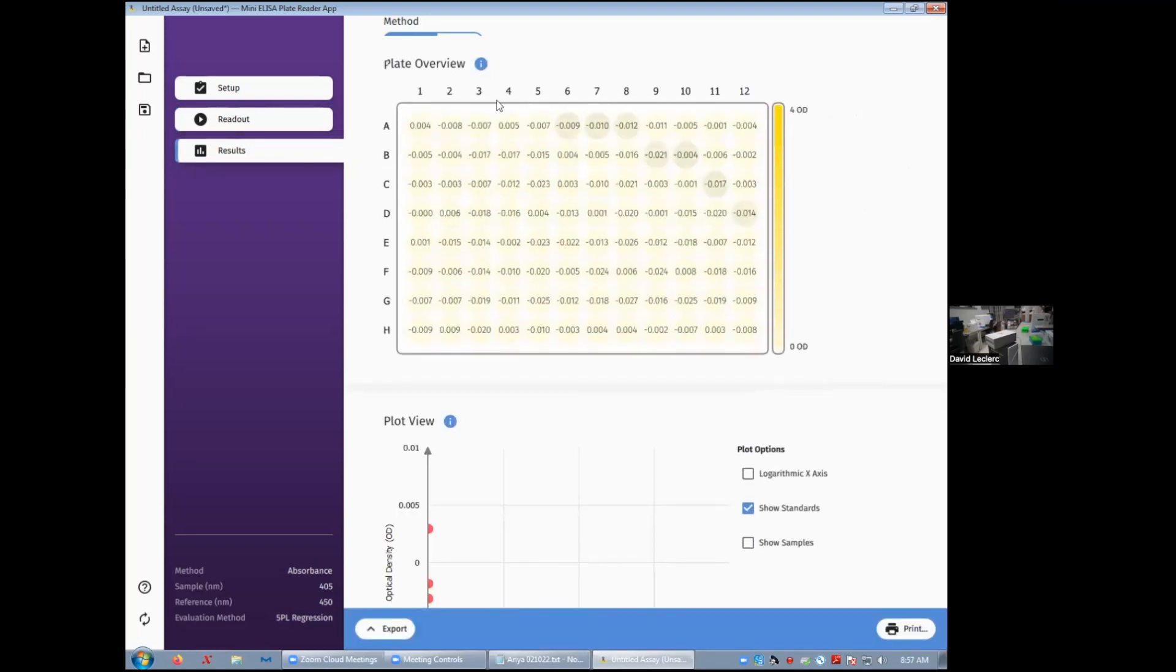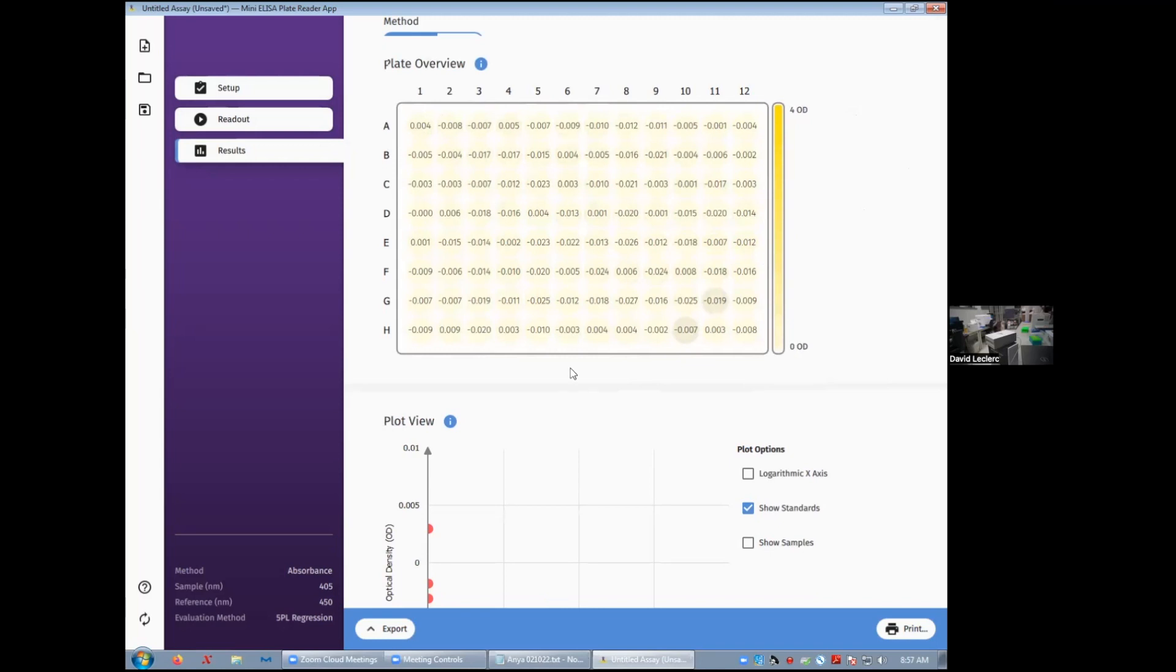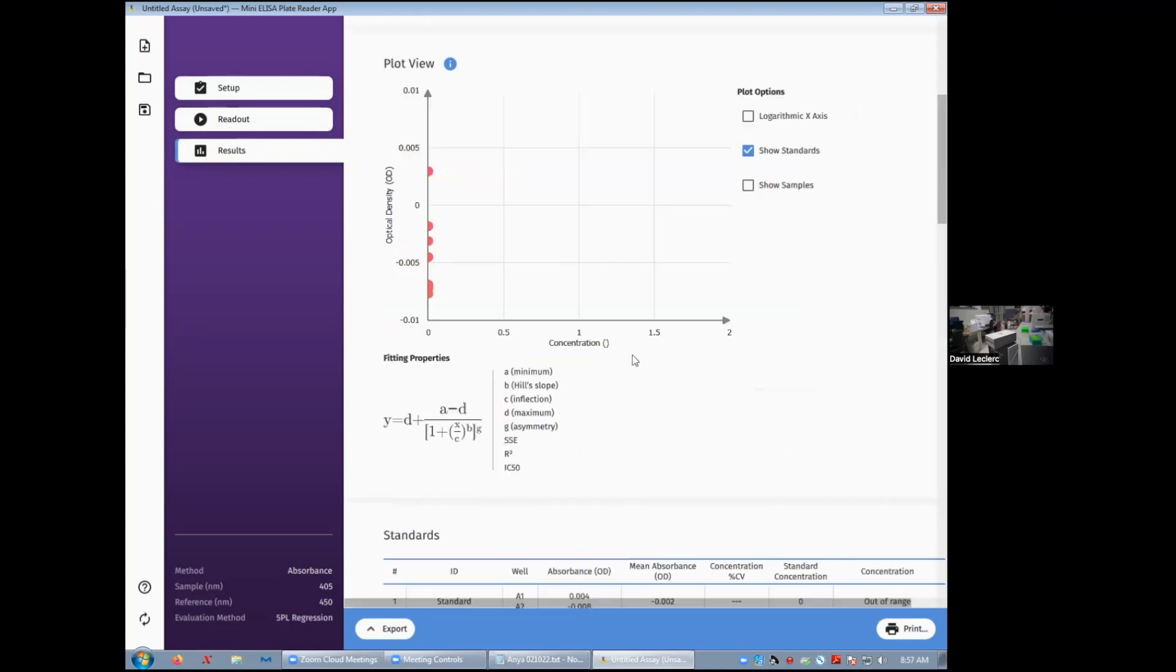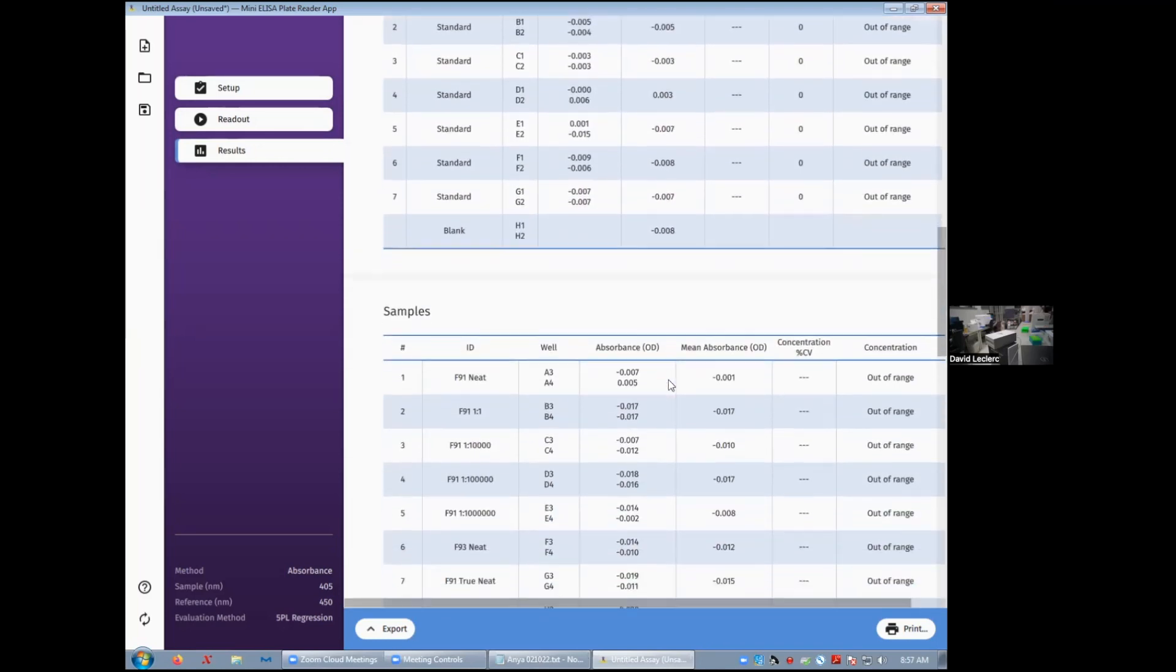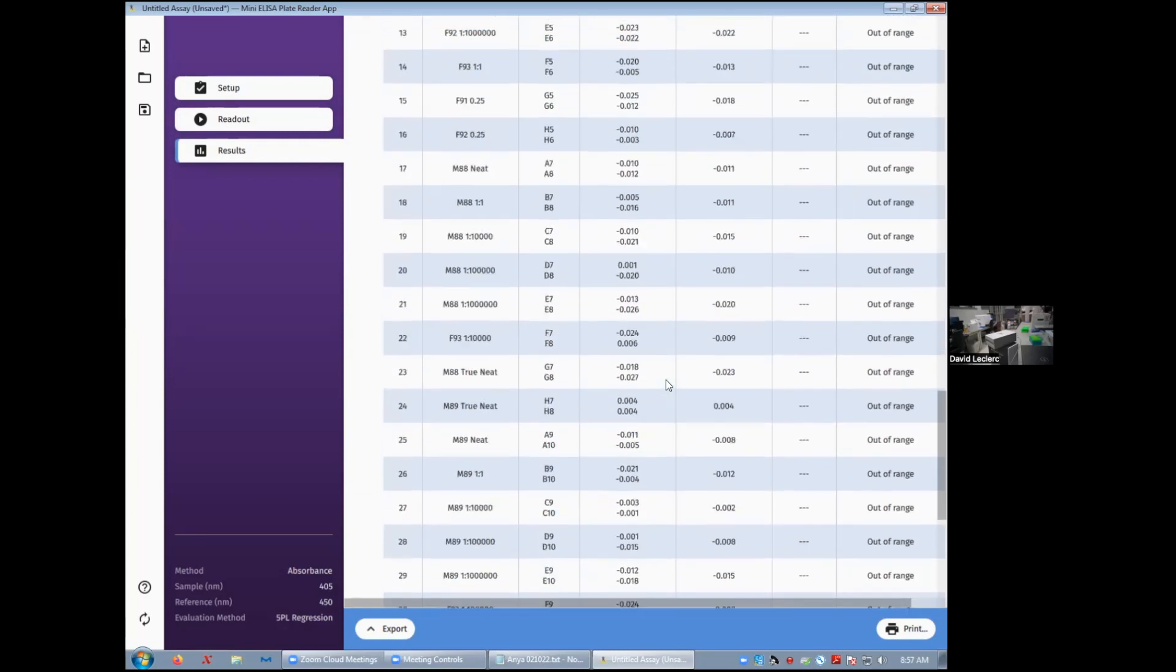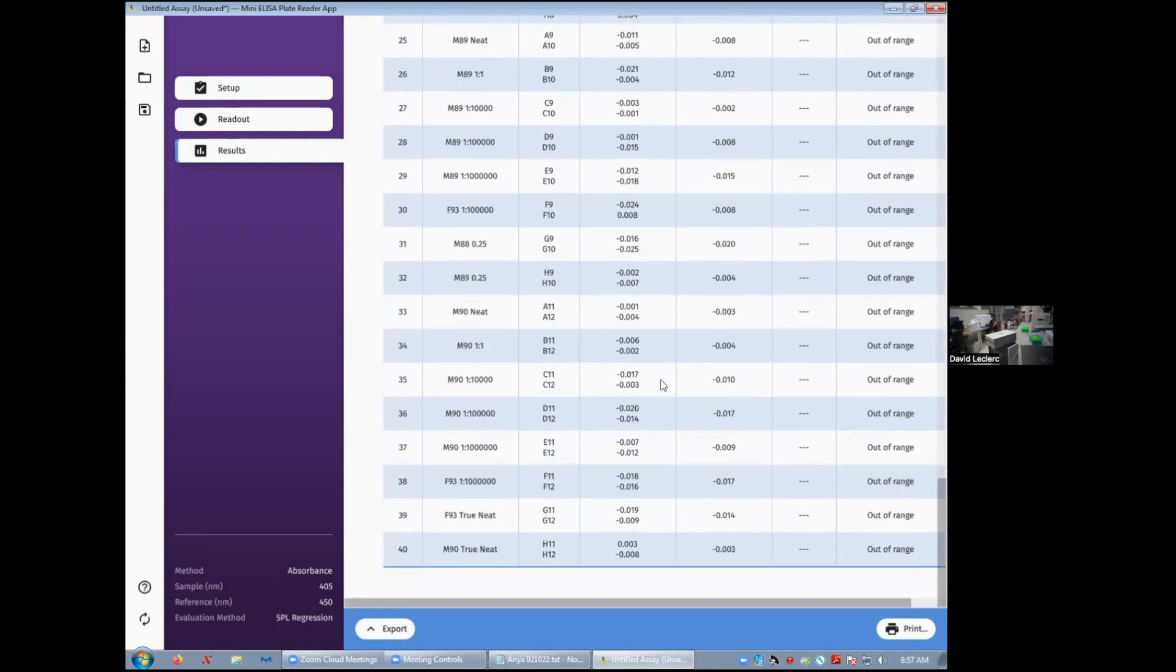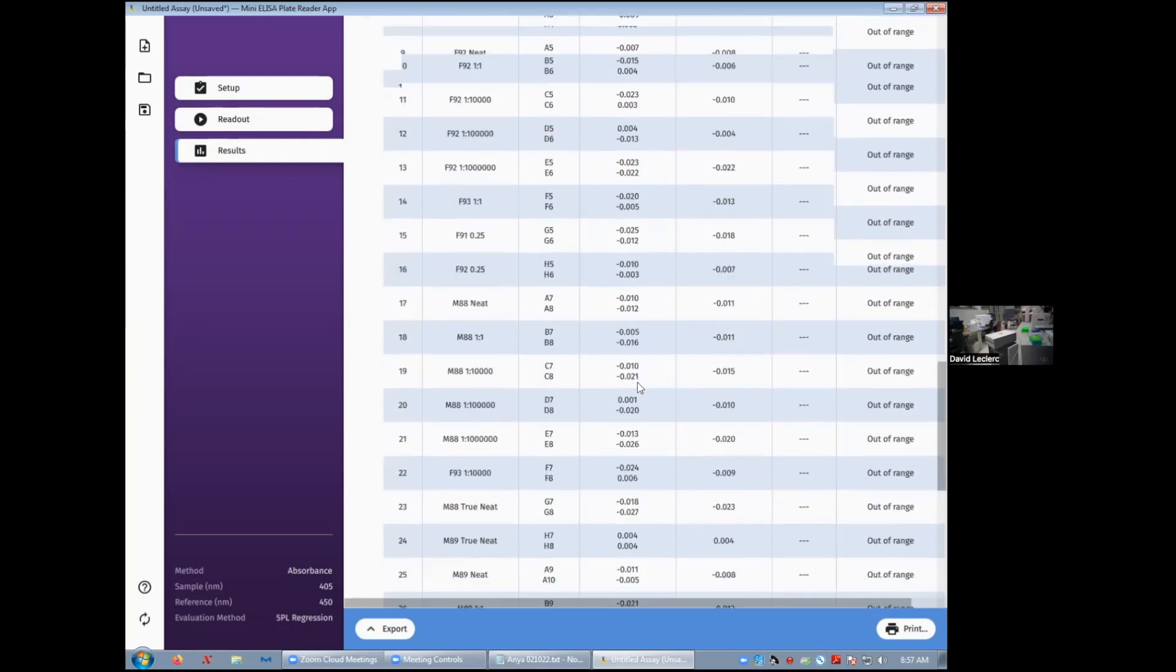Now, all of these readings over here, obviously I didn't do an actual ELISA for this tutorial, so these are all empty wells. But typically you would get the readings for your standards and samples. The data will be graphed automatically. And you get the results at the bottom here.